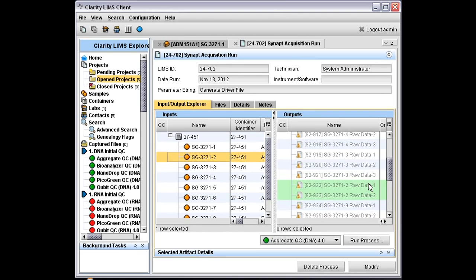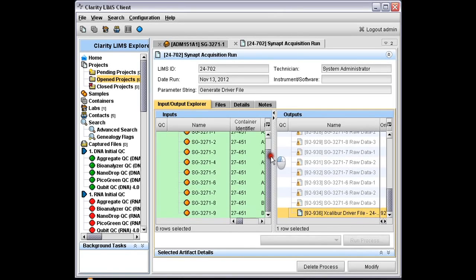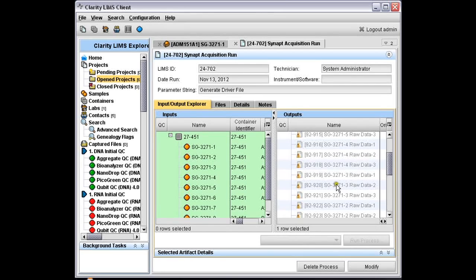And the last thing I wanted to show here was this in reverse, i.e. if we select an output, in this case the shared output, we'll see that it relates to all of the samples, which makes sense because it's shared amongst them. And similarly, if we pick the result file placeholder for an individual set of raw data, we can see which sample it relates to.